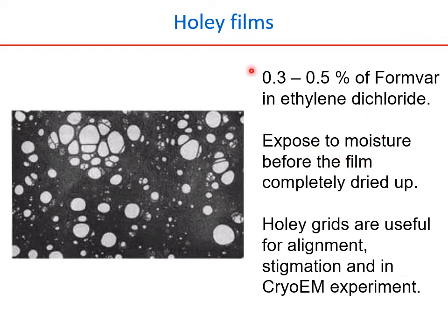So all this, even though it looks like a very tedious job, if you are careful enough or skillful enough, you can just manage it in no time. It just goes in a flash of a second. Dip it, expose it, and just take it away from the moisture so that the film will be formed. Even though I took so long to explain, the process is dip it, expose it, and take it out. So it just goes within a second.